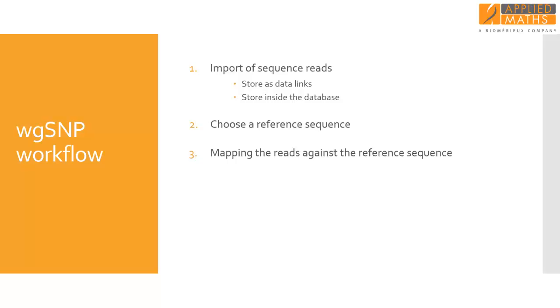In the next step, the reads are mapped against the reference sequence, assuring that all genomic sequences are in the same frame and have the same length, which is an important prerequisite when you want to do a SNP analysis. Mapping the reads can be done locally or using the external calculation engine.